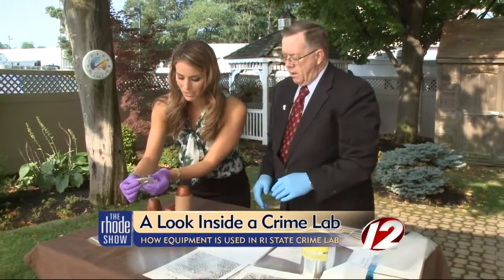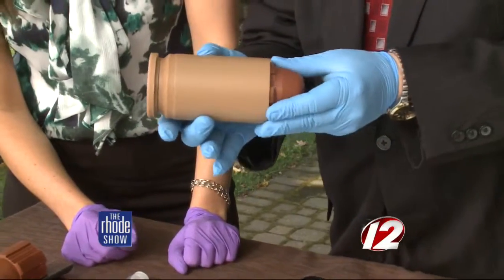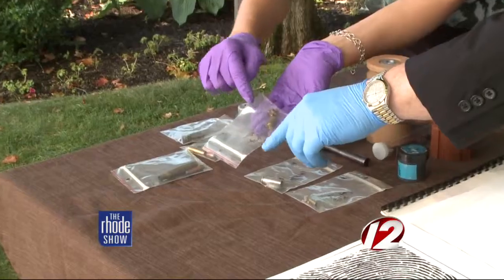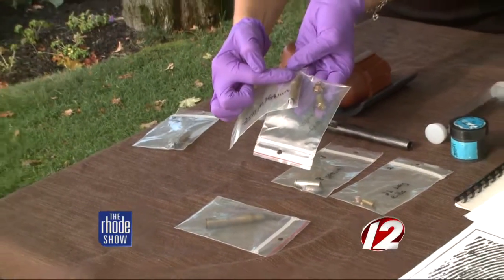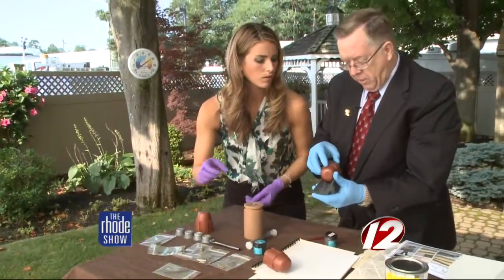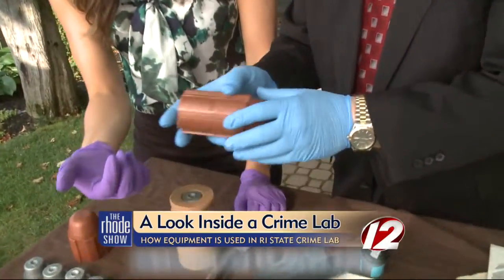When there's some sort of crime involving a gun or a bullet, you have these bullet casings. This is a mock-up of an intact bullet — this would be the cartridge. When you fire the gun, the firing pin hits the primer, which sets off an explosion inside the cartridge, and the bullet comes out. If it's semi-automatic, the cartridge gets kicked out. So from a .22 to a 9mm to .357 magnums — different sizes. The back of the casing will have markings from the firing pin and breech face, and the bullet will pick up markings from the barrel. The bullet actually twists, creating ridges. When you look at these under a microscope, you put them together and look to see where they match up — and that's how you know that bullet was fired from that certain gun.